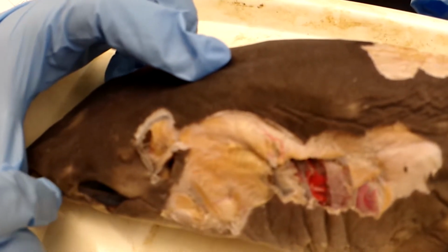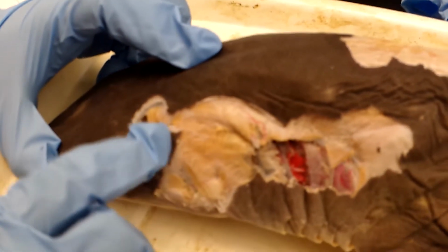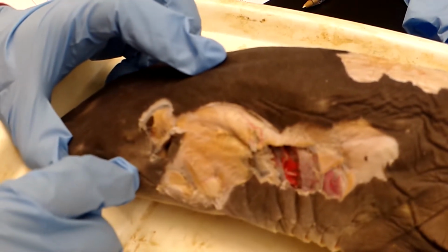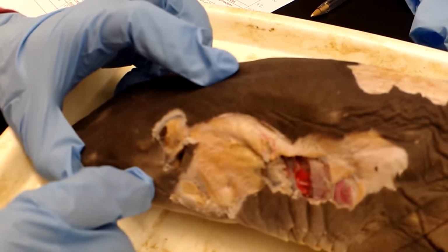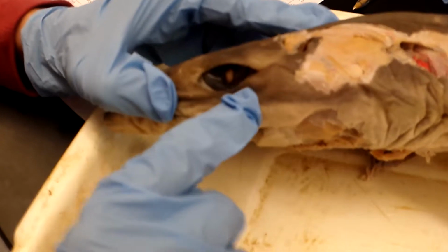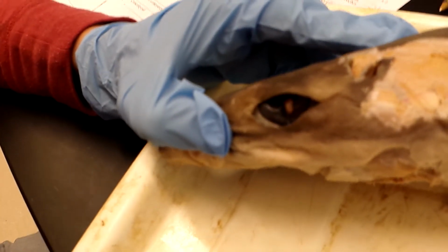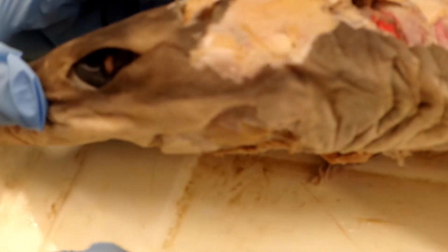The next muscle is the adductor mandibulae, also found in the general area in here, and its origin is the palatoquadrate, insertion Meckel's cartilage, also homologous to the adductor mandibulae anterior and exterior. And the next muscle is the preorbitalis, which is found under the eye, and its origin is the ventrochondrocranium, insertion Meckel's cartilage, and it is homologous to the adductor mandibulae anterior and exterior.